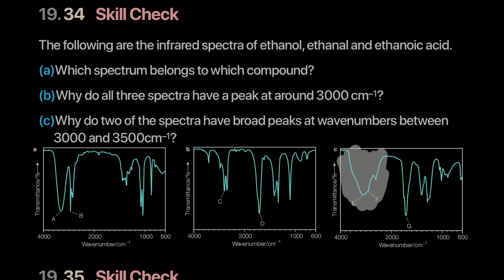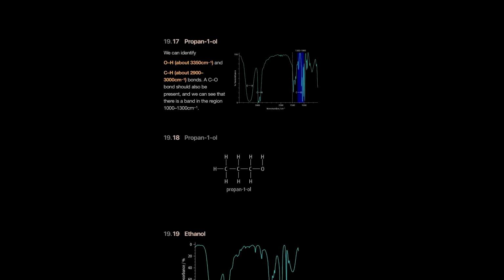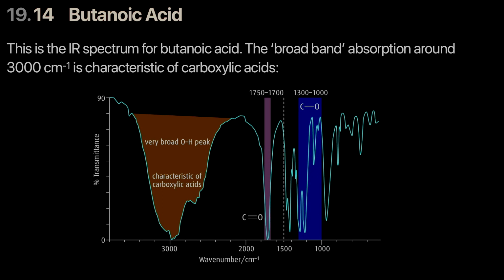All right? So that's the first thing I want you to start realizing, how easy it is to identify at least one functional group. Which functional group? Carboxylic acids. That's what I want to start off with first, and I'll continue everything else. Remember, a carboxylic acid has unique functional groups, bonds. So you are looking for the CH bond, which exists in every molecule. That's the one right here. You're also looking for a CO bond and an OH bond.